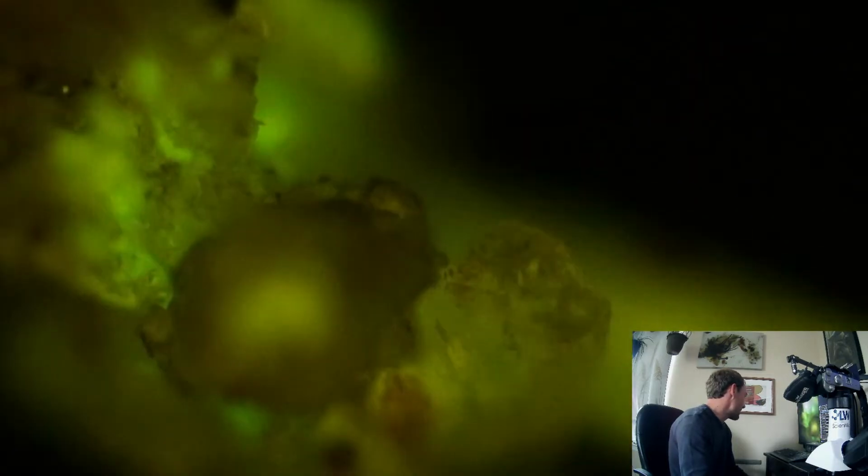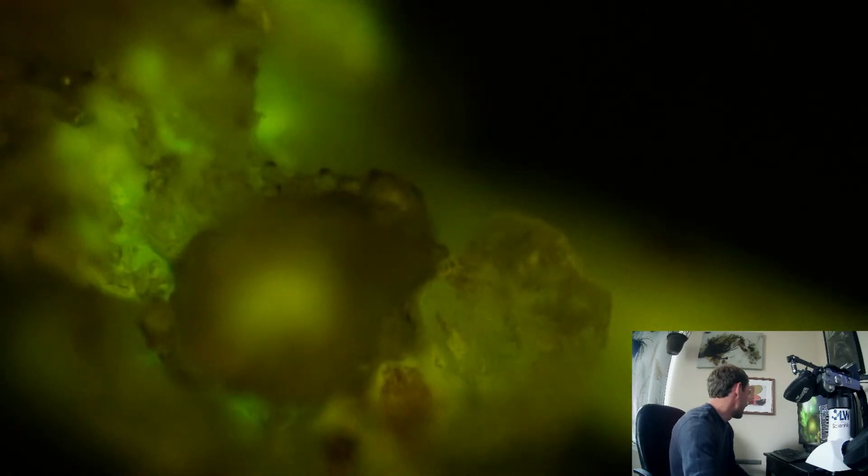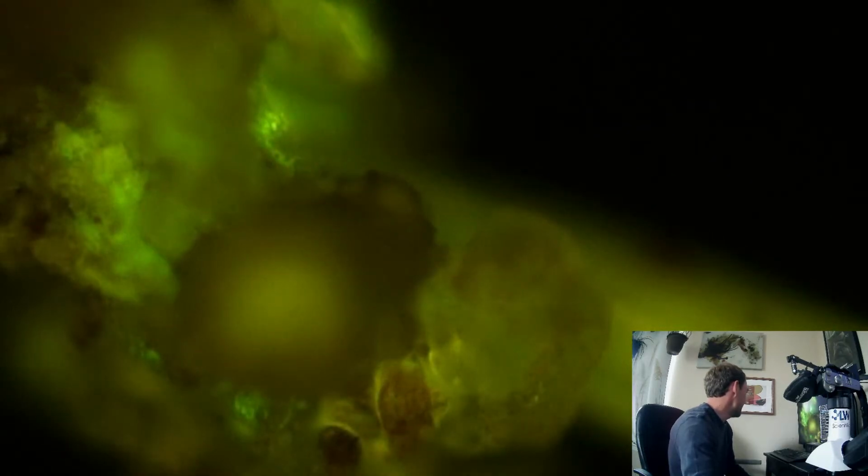I got quite a bit of noise, but do a little bit of focus. Pretty neat looking. That's a cool looking little mineral cluster. Almost looks like a brain right there.